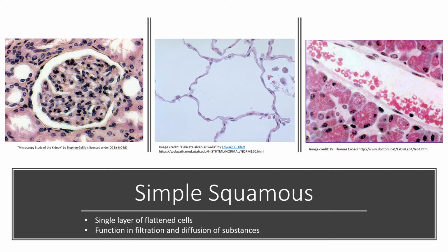So the first place we're going to see it as an example is here at the glomerulus. Do you see how there is a line that goes here, and then there's a little bulge? Line, line, line, all the way here, forming the lining of this glomerulus, and then here's another bulge.